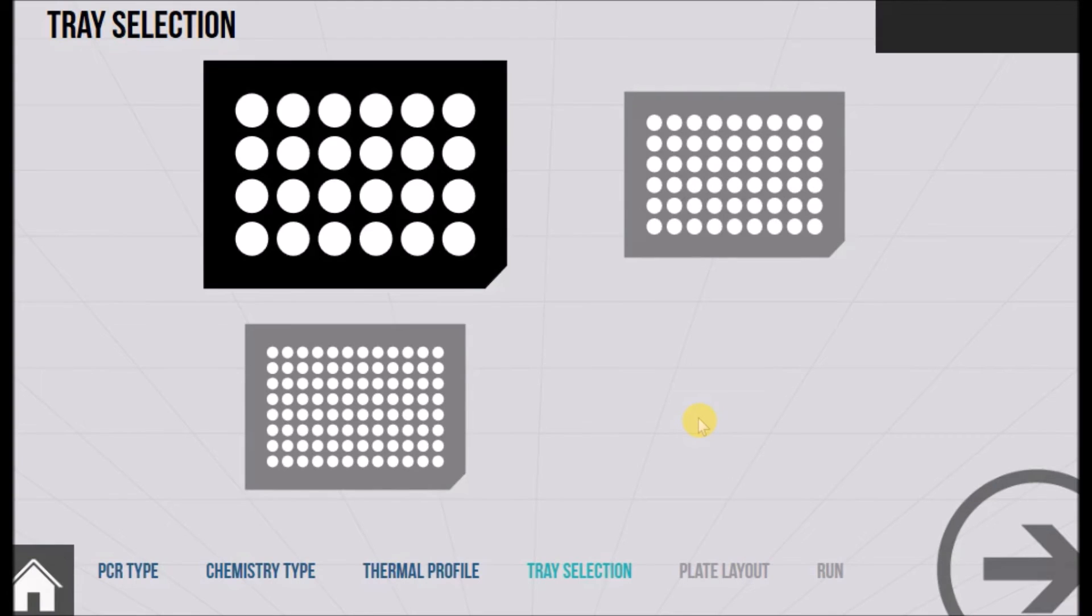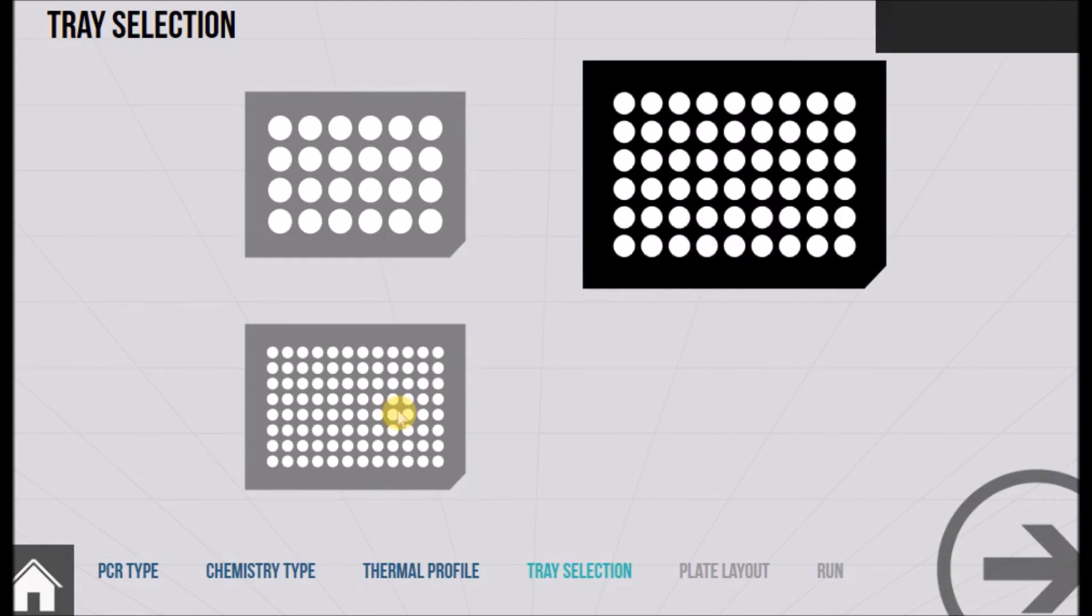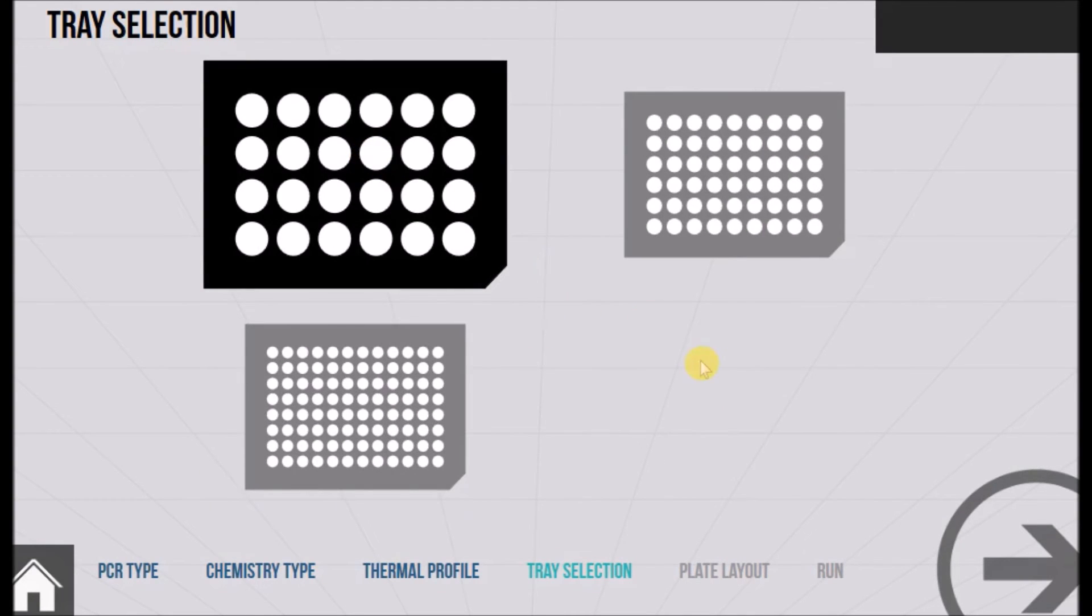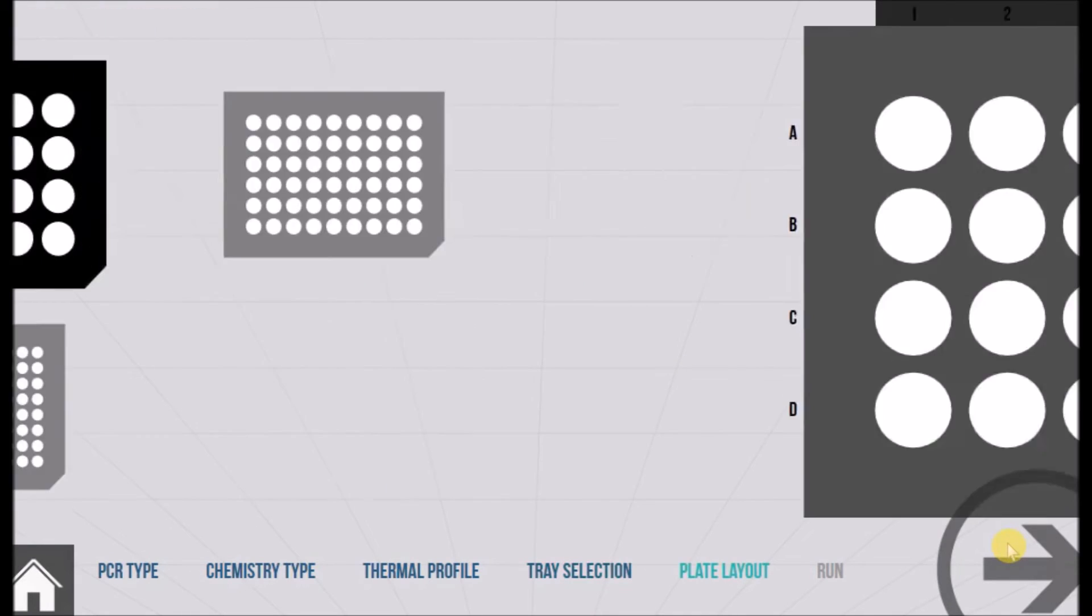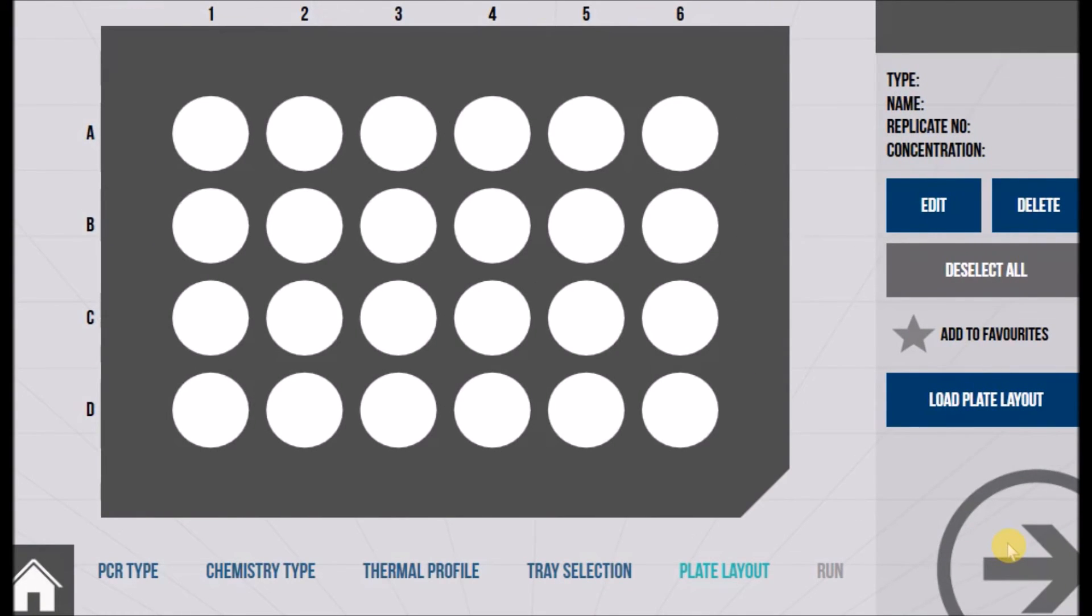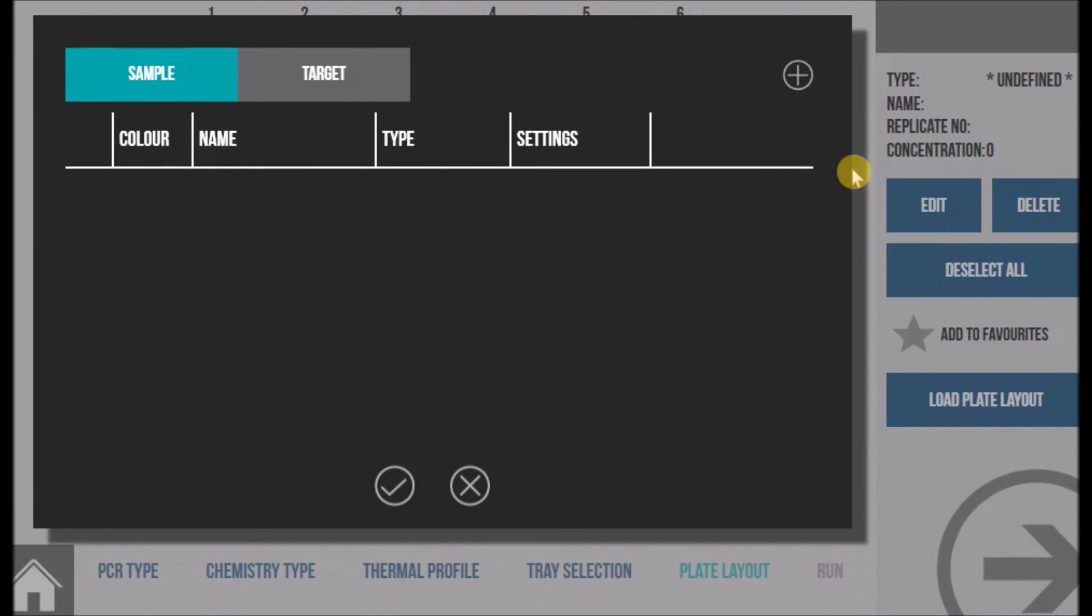The plate size being used is then selected and pressed next. This here is an optional page used to label the wells. You simply select the wells you wish to label, and then press edit. Here you can push add to add a sample or target type.